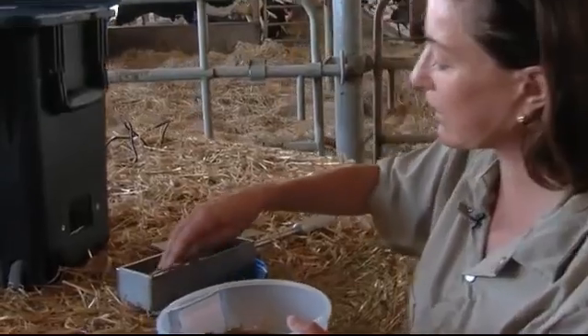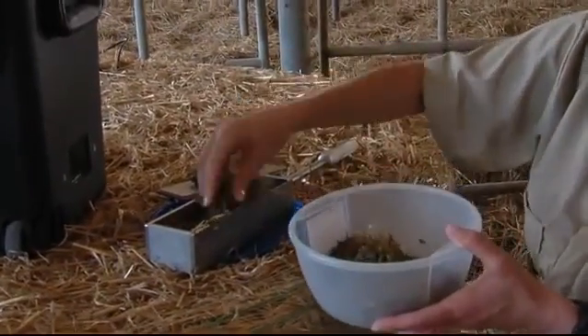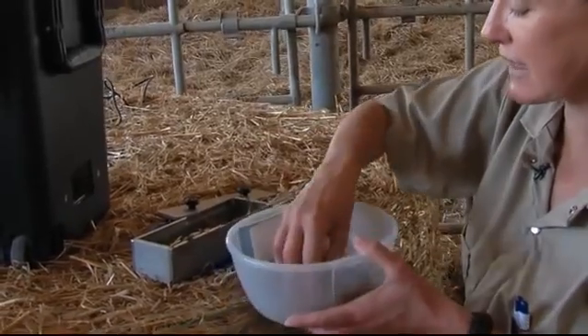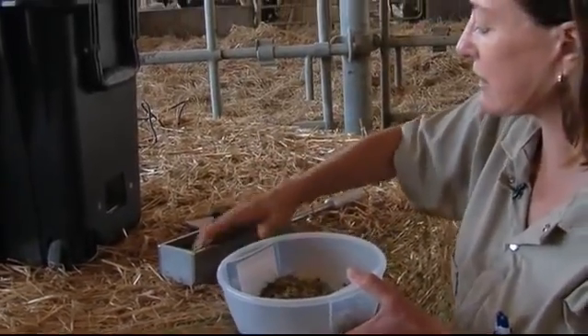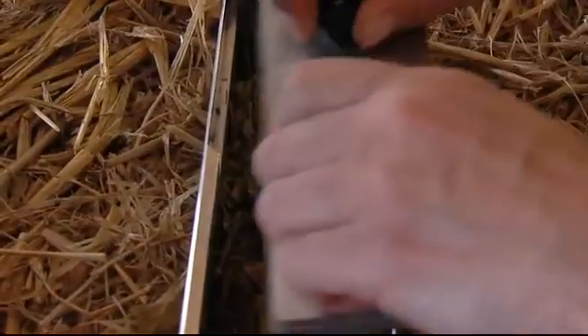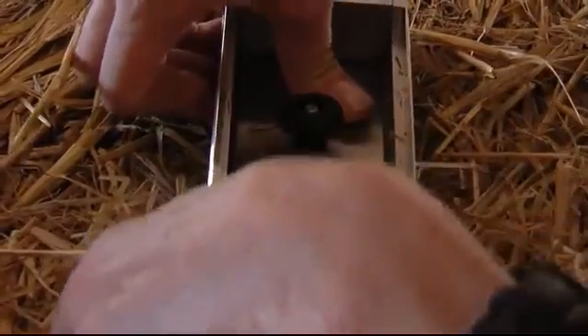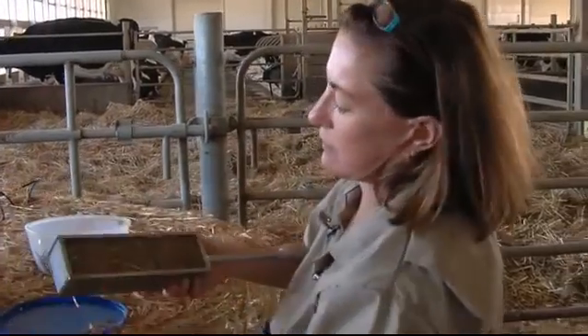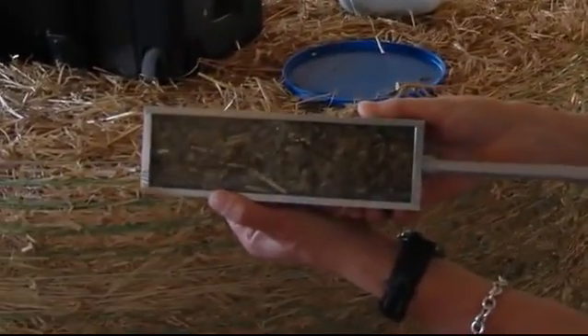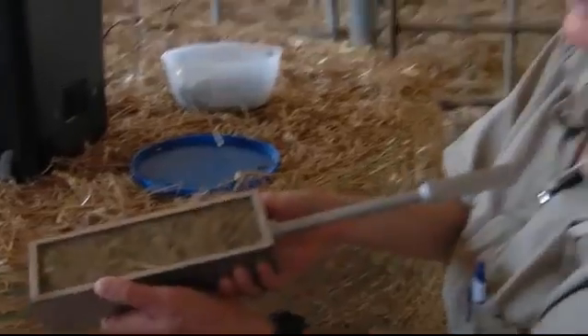I put this sample into this cell, making sure that I have a good sample in there and then packing it in so that it's nice and tight in the cell. I place this bar over top and then pack it in even further so that you can see the sample is in the cell, and I'll pass it through the eye of the NIR.